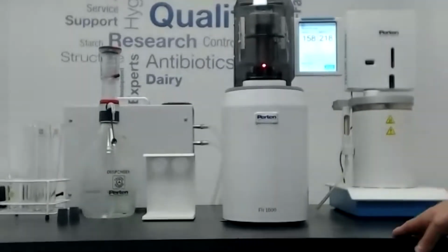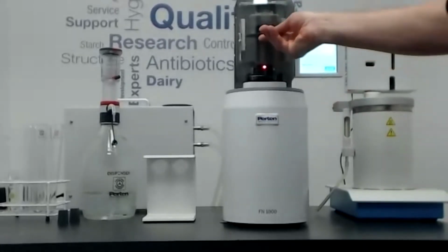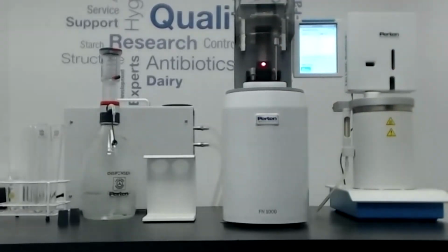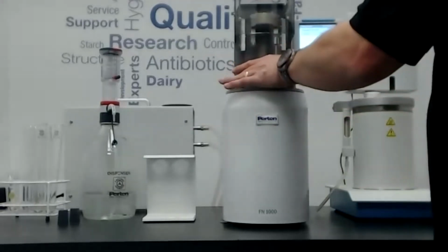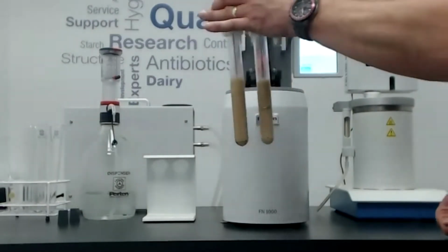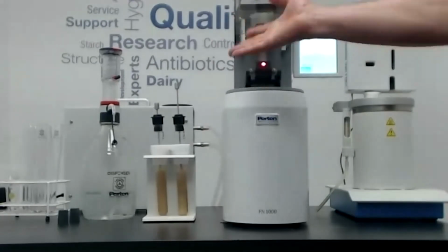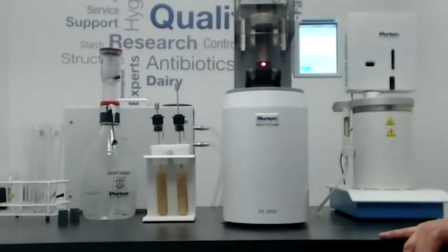Okay, this test, we don't know how long this is going to go on for, so I'm just going to manually stop the test. So when we lift it out, we want to make sure we're touching the plastic cassette so we don't burn our fingers on the cassette stand, and then you would clean your tubes carefully. If you've got a solid tube cleaner, you would put the plastic protection cup over the end and clean the tubes and make sure that they're clean and dry before next use.